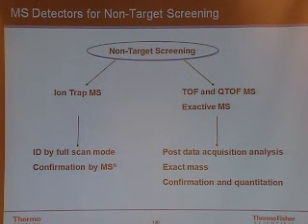The other one is if you put a time of flight in any room, any laboratory, and the temperature goes up or goes down in the morning or in the evening or during the day, they're very temperature sensitive, and a temperature change of 2 degrees means you have to recalibrate. So they're useful tools, but they're semi-quantitative. And the other major problem is that today you can get molecular ions measured to 0.001 AMU. That means that they're accurate to and reproducible to 1 millimass unit.